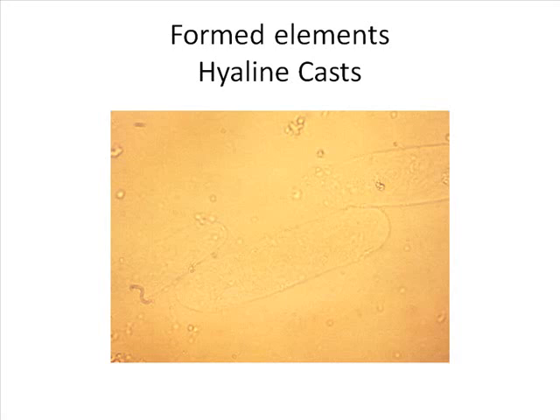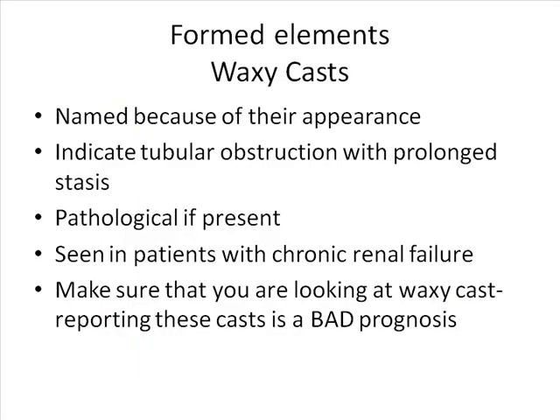It's not that real bright, refractive thing. This is a very light, sensitive formed element. You want to make sure that you have your microscope in the correct order. You want to make sure that it is low light so you can see them.